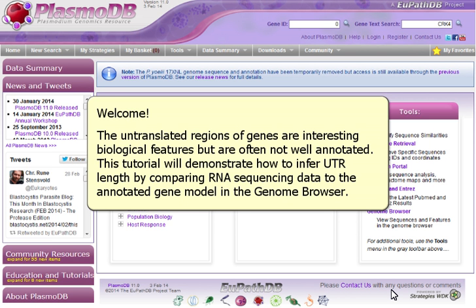This tutorial will demonstrate how to infer UTR length by comparing RNA sequencing data to the annotated gene model in the genome browser.